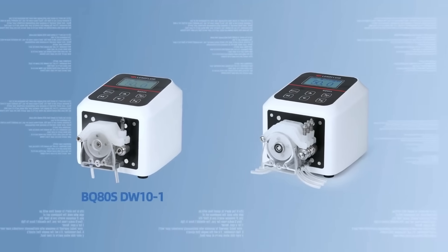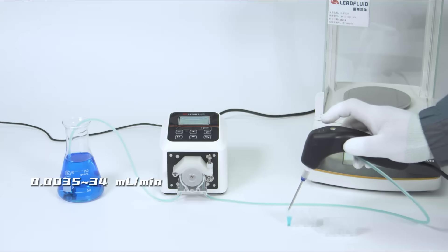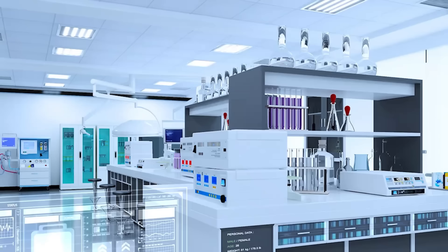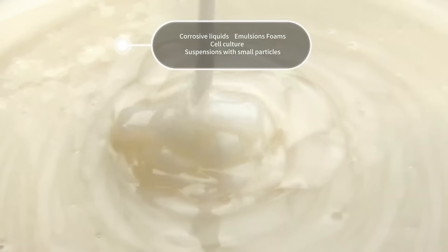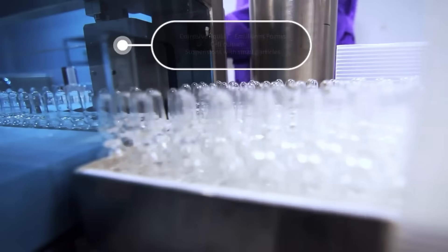It comes in two models — BQ80S DW10-1 and BQ80S DW10-3 — with a low flow rate ranging from 0.0035 to 34 milliliters per minute. It offers a speed accuracy error of less than plus or minus 0.2%. The BQ80S is suitable for various liquid transfers, including corrosive fluids, emulsions, foams, cell solutions, and suspensions with small particles.